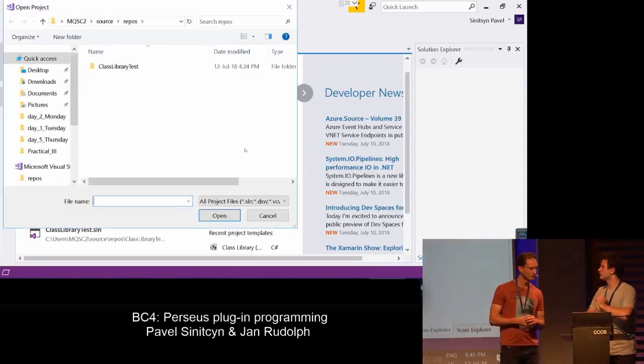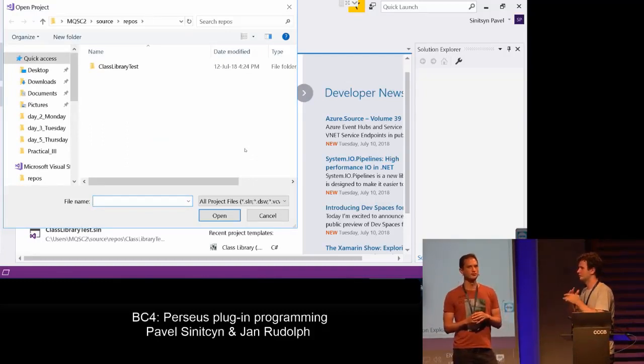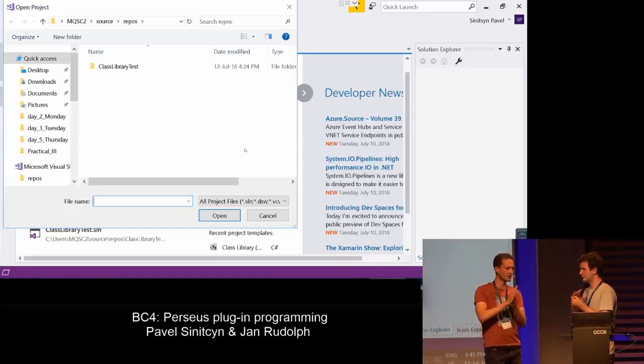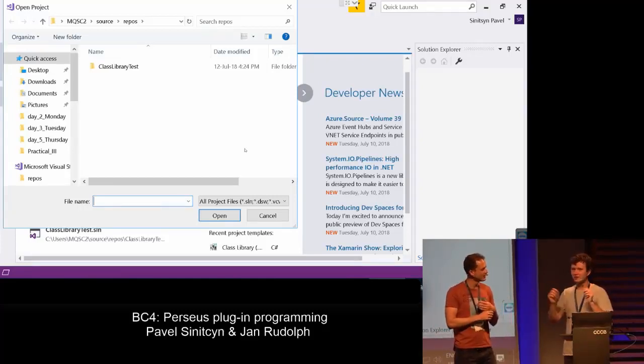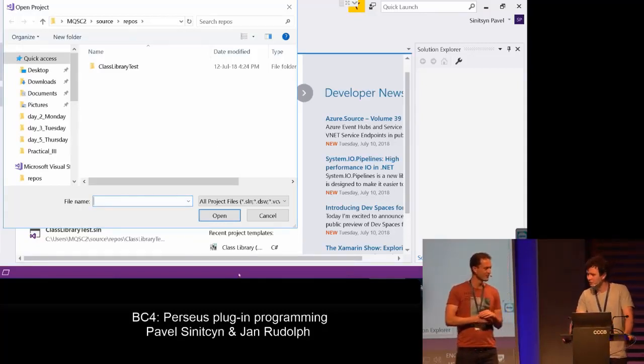No, let's start from another point. What do we want to do? What do we want to make in Perseus? I think it would be cool if I could take my matrix. Basically, I usually only like to see the first few lines because I get confused. So I would like to be able to take, for example, the first 10 rows of a matrix and ignore all the rest. In Bash, there's a special command for this. It's called the head command. Head, like header. Give me the head of the file. So yeah, cool. We want to use the head.